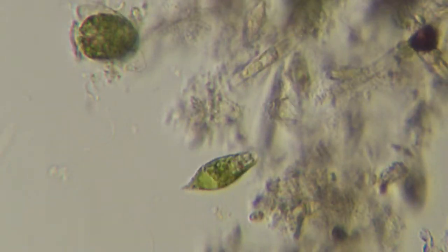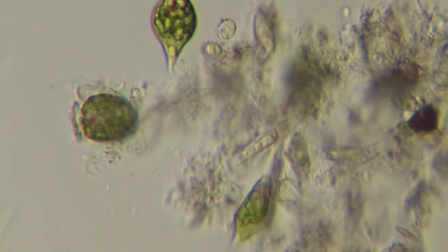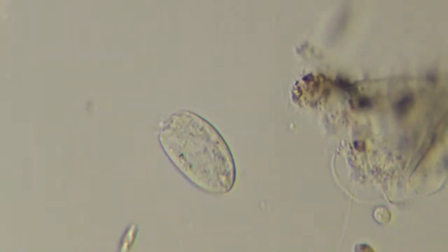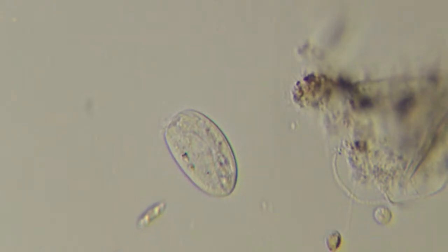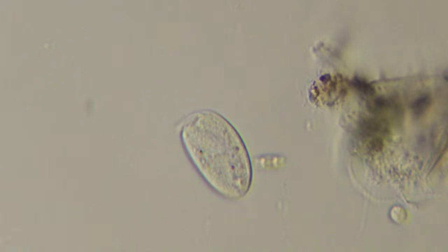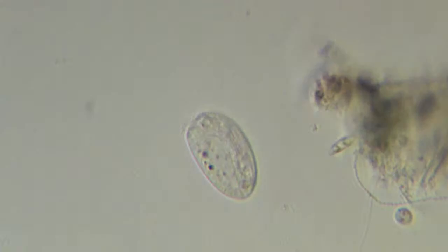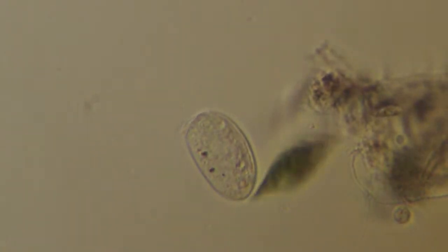And more good Euglena shots there. I saw some water movement, which means the slide is starting to dry out, I think. Getting some pulsating. There's another cool flagellate there. You can see it's got a long flagellum curling near the top. Play with the contrast a bit. You can see a little bit better.